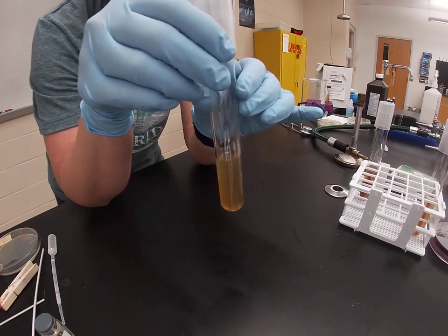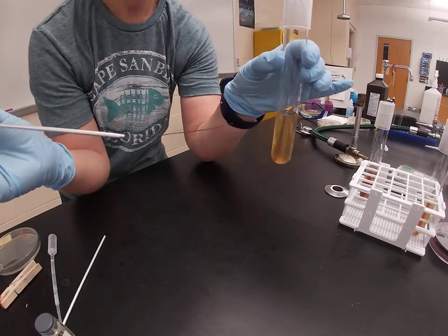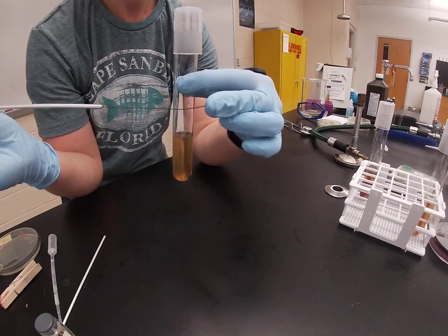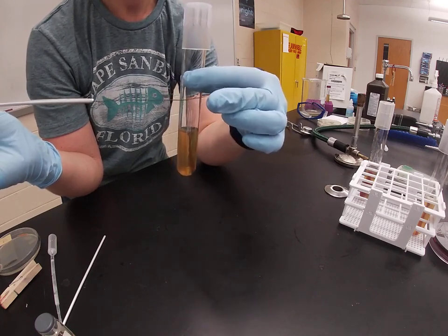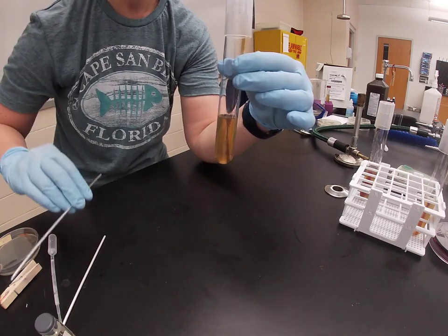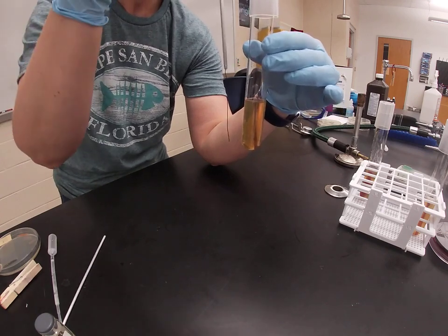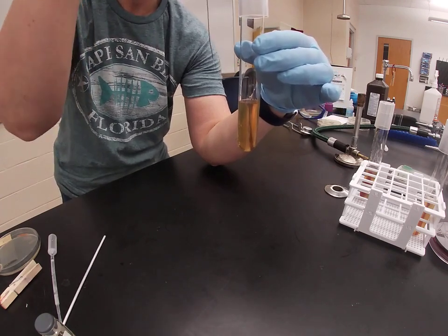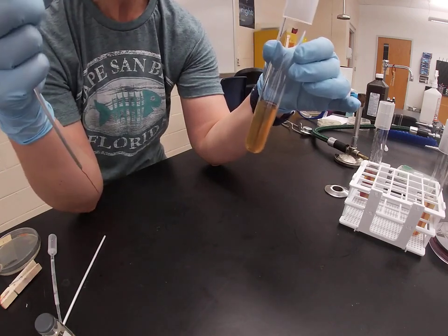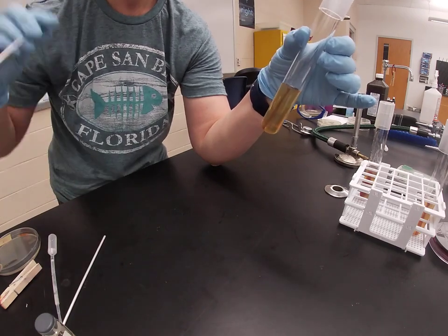And we actually inoculate our motility agars using an inoculating needle instead of an inoculating loop. This is just like an inoculating loop, except for it lacks the looped end. Instead, it's just straight. And you use it in the same way. You incinerate the same way and you just pick up bacteria with the end of the needle. When you inoculate motility agar, you just want to go straight down all the way to the bottom and then straight back up, following the same path that you went in with. This is to restrict the path of the bacteria so that they are taking up less space.